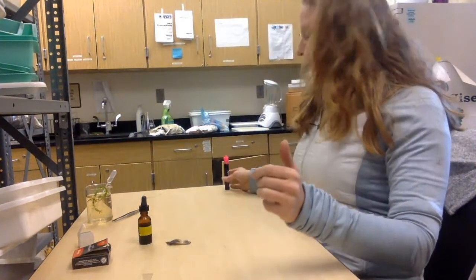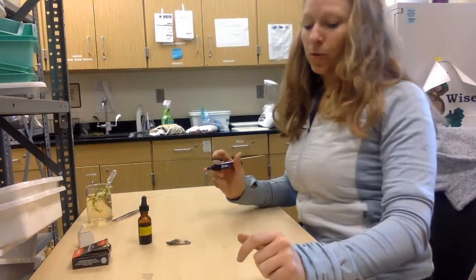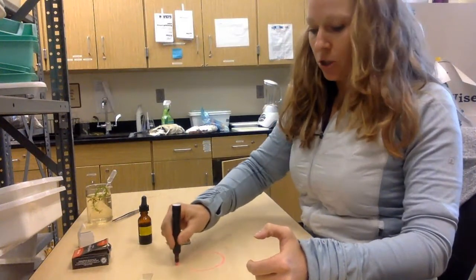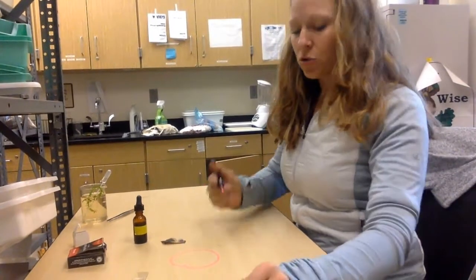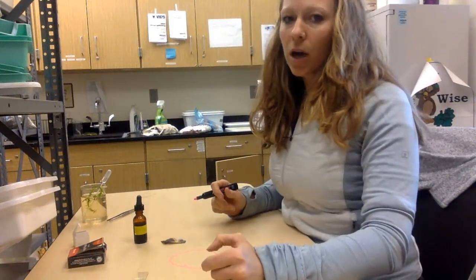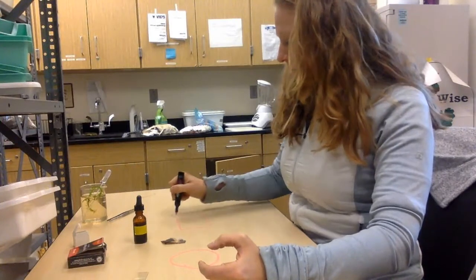When you're creating your pre-lab, it says to draw spaces for your field of view. If we were just looking straight into the microscope, I would have you guys draw a circle, because when you look into a microscope, you see a circle image. However, we are using the digital imagers, so our field of view ends up being square.